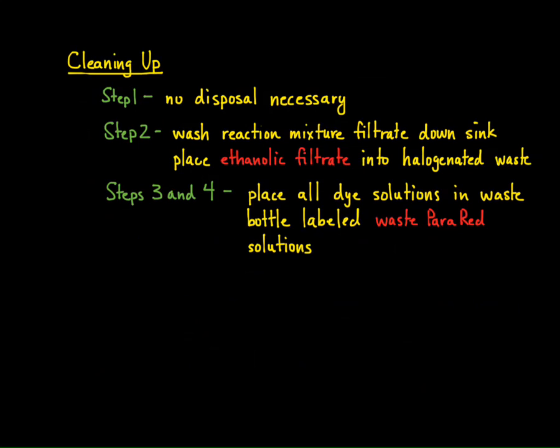To clean up, you need to wash the filtrate from the reaction mixture of the para-iodonitrobenzene down the drain and the recrystallization filtrate into a halogenated waste container. Then place all dye solutions in the waste bottle labeled Waste Para Red Solutions.